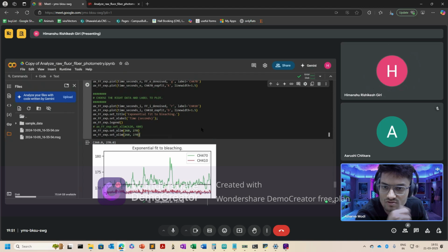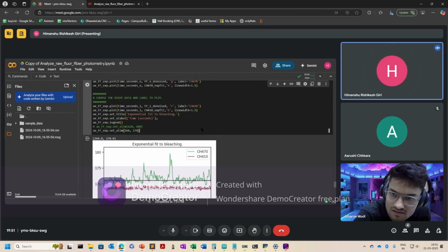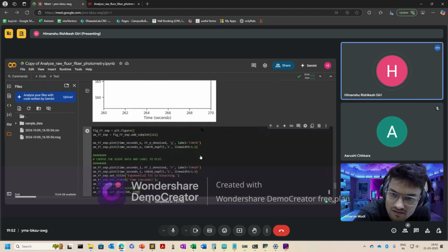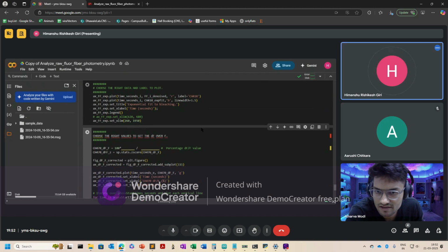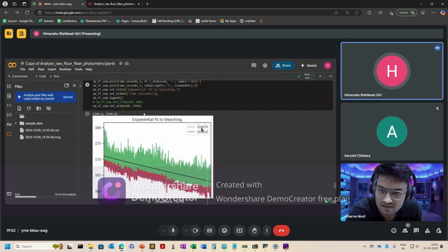Basically, you have two plots. Plot it in that range, maybe 1950 here and 1910 there. Here you see that the mean value in that short period is okay.